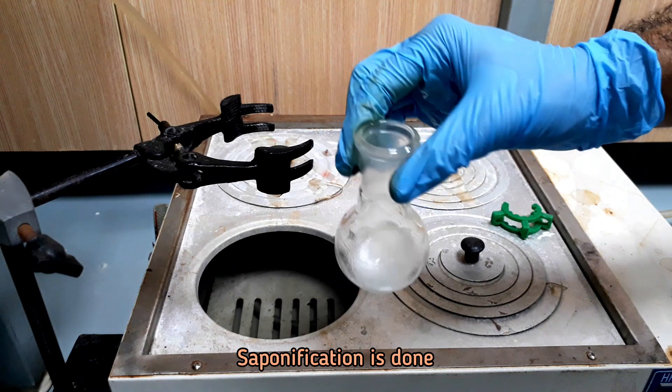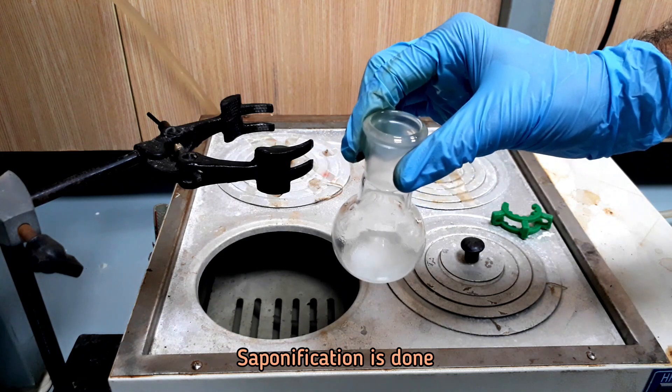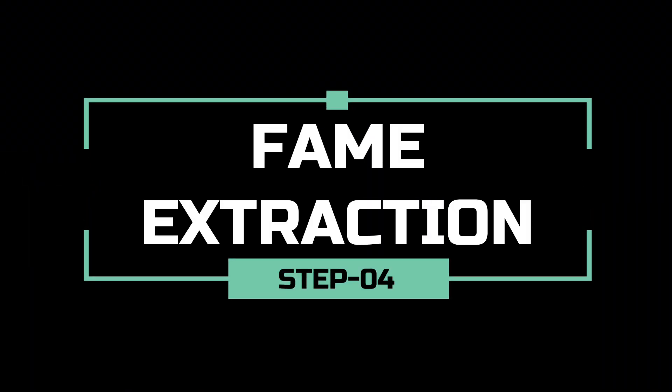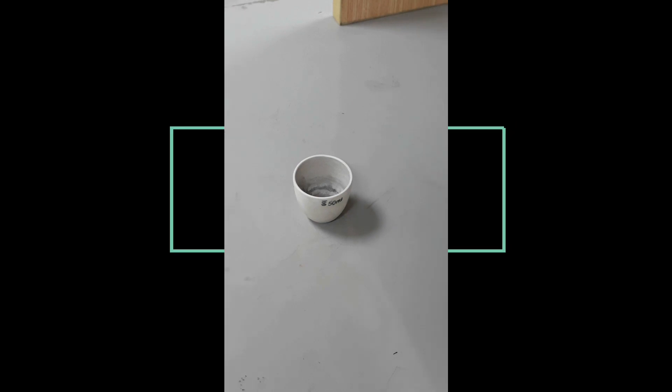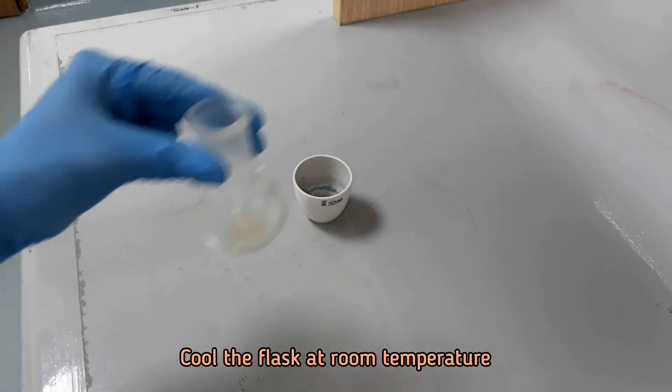Saponification is done, cool the flask at room temperature. In this step we will extract the fatty acid methyl ester content which was formed by acidic catalysis during the saponification of the oil sample.